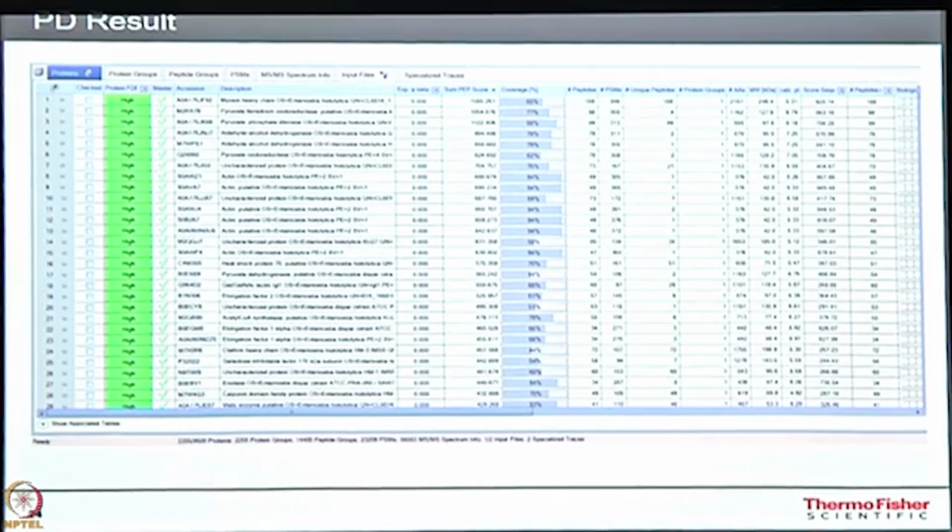What is meant by a unique peptide? A unique peptide is one present only in that protein and not in any other protein included in the database. So in whatever database you are using, that peptide is not present in any other protein. We are looking for at least 2 or more unique peptides. That kind of data will be very good data.